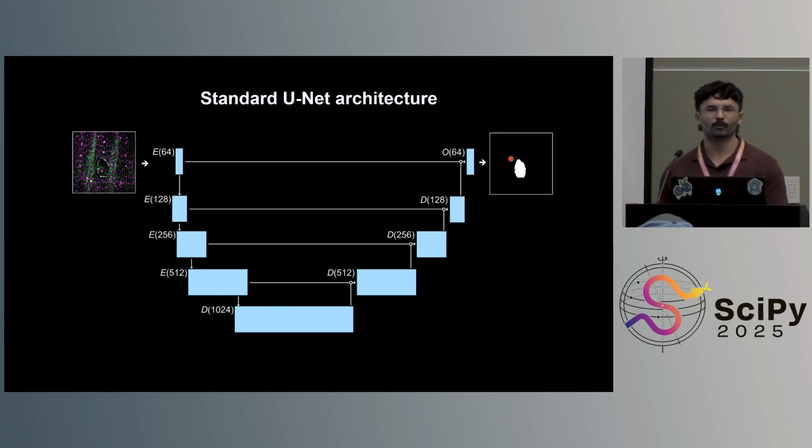Now, UNets perform quite well on bright, well-defined images, and importantly, on very small data sets. However, they don't extend well to video data. And that's because UNets are unable to use that temporal information that is abundant and important in videos.